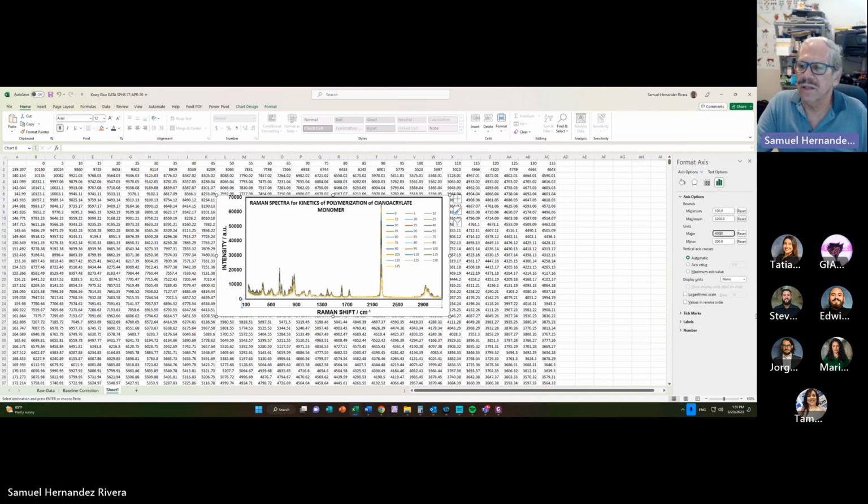Okay, next thing, go into tick marks, which is close to the bottom of the format axis text options. So click on tick marks, and it says make a minor type. On the major type, press outside. On the minor type, also press outside. We're almost done, but not quite.